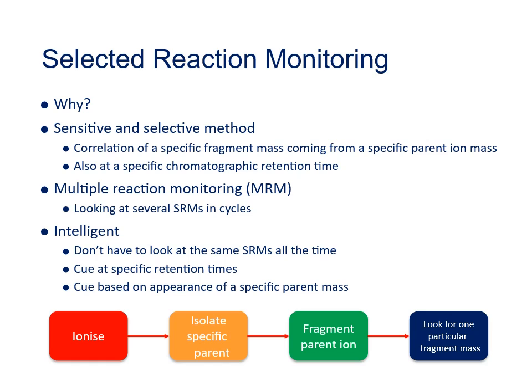To increase the specificity even more, sometimes a related method called multiple reaction monitoring is used, and that's where you have the system look for more than one specific fragment coming from the parent ion of interest.